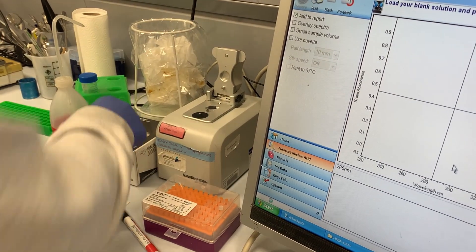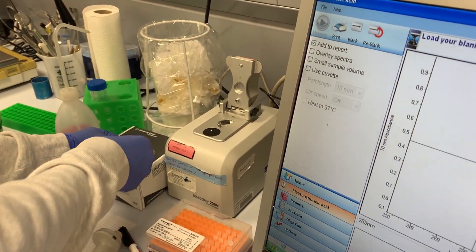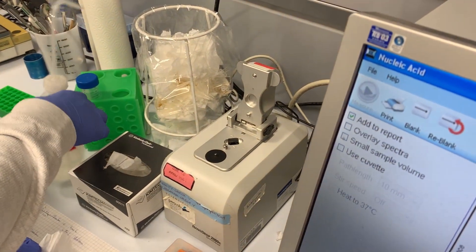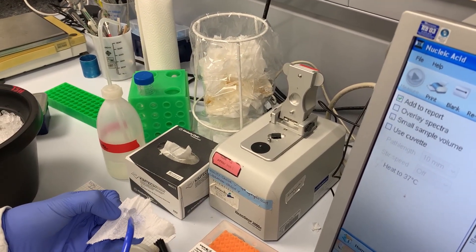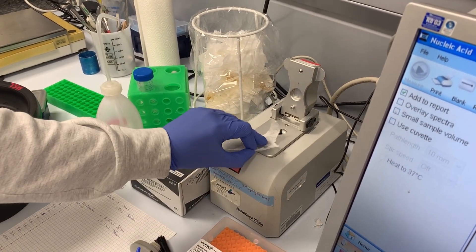But before you can blank, you have to clean the area of measurement prior to use. So you take one of these laboratory wipes and apply some distilled water onto it, and then you clean the area of measurement.